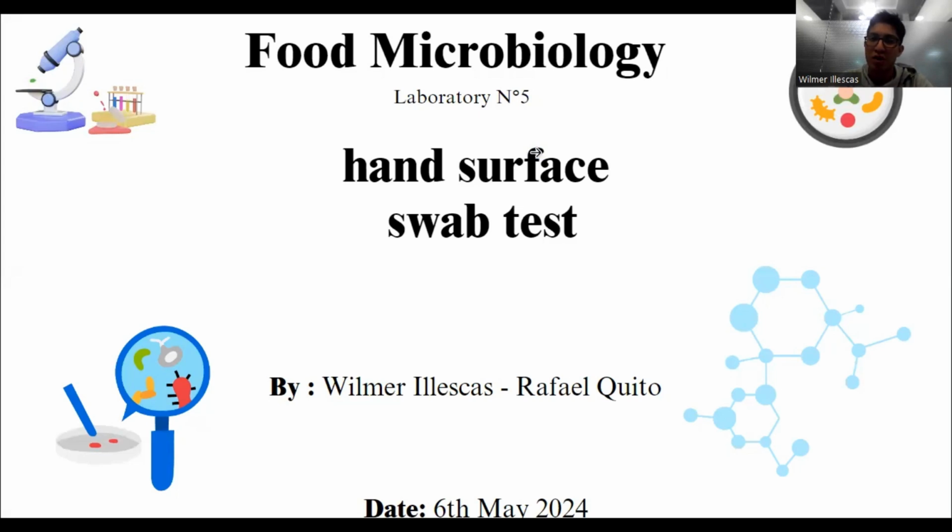Today, we're going to present laboratory number 5 of food microbiology. We're going to be talking about the hand surface swab test. So let's begin.